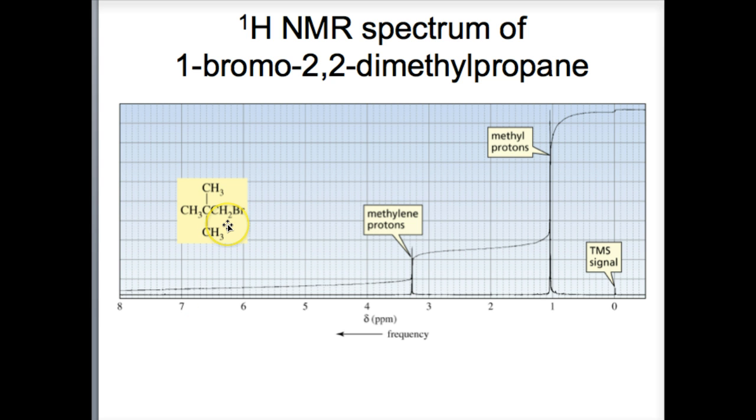And here's our compound, and protons in this methyl group, this one and this one, are equivalent, and then we have the methylene protons on that carbon. So these are A, generate the peak at A. Call this A. We'll call this B, and these 2 protons cause this peak. And why is this peak intensity higher? Of course, it's because it represents 9 protons of the 3 methyl groups, but only 2 methylene protons are represented by this peak here.